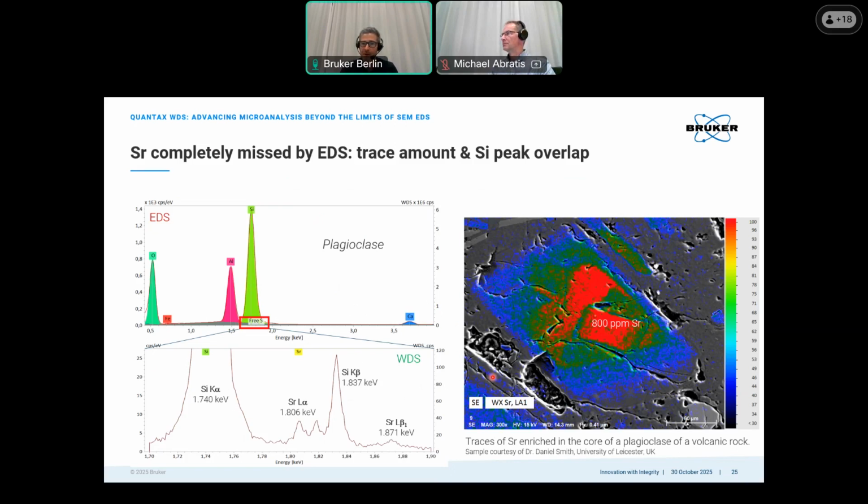There is another question. Is it possible to change diffractors to change the sensitivity for low or high elemental range? If so, if a customer works with low energy range, can we modify the diffractors? So let me answer that. So maybe you remember the slide I showed where we compare the spectral resolution and the limit of detection.